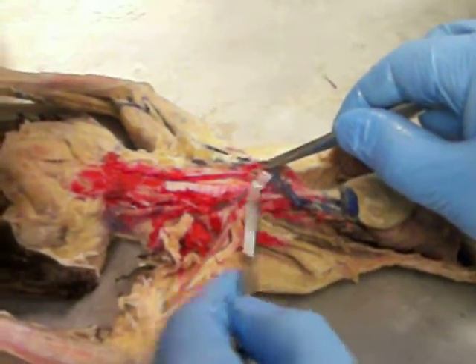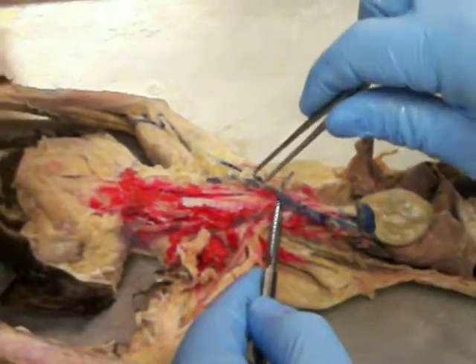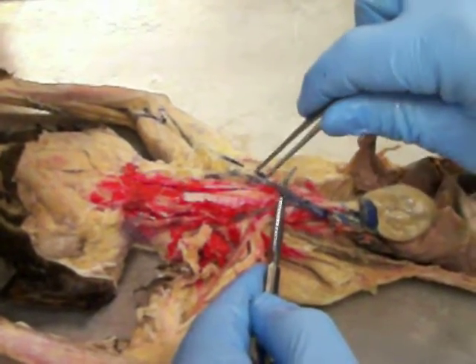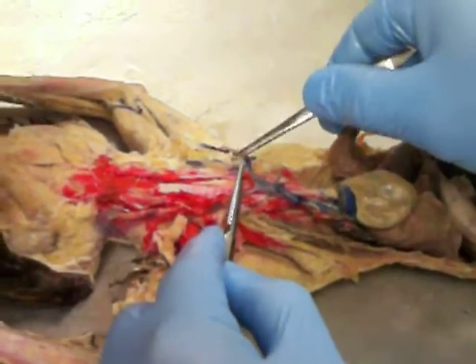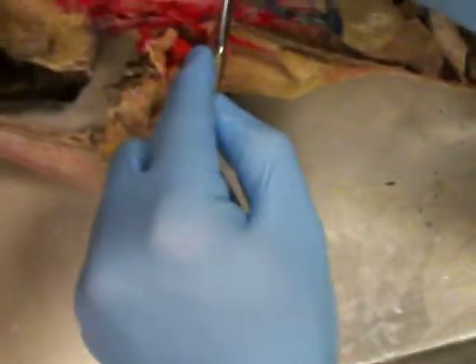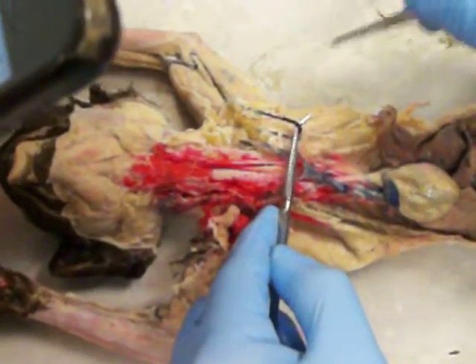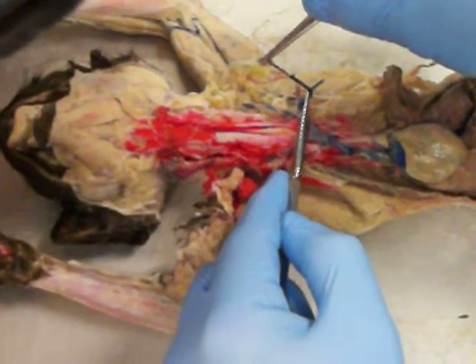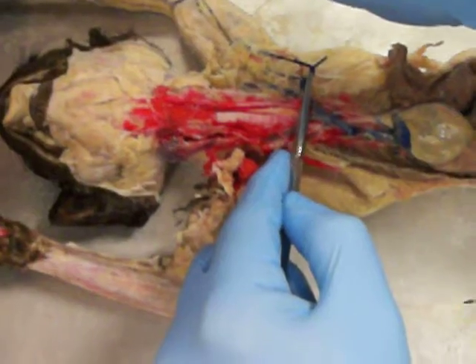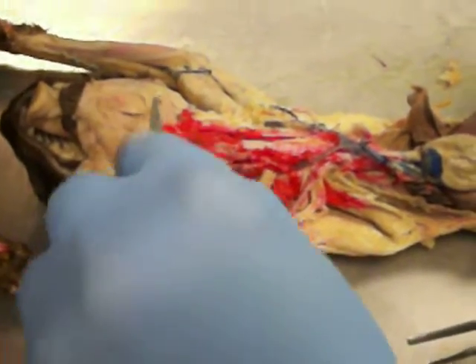The brachiocephalic veins are going to branch into the right external jugular vein, left external jugular vein, and left subclavian vein. Now the subclavian vein is going to branch into left axillary vein and left subscapular vein. Now the left axillary vein is going to continue out across the arm, where we call it the left brachial vein. And then up here we call it the median cubital vein, and this will be the left side. And then we also have our transverse jugular, which on this cat appears to be missing, but it goes right across here.